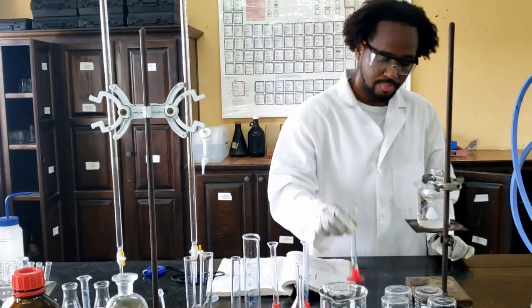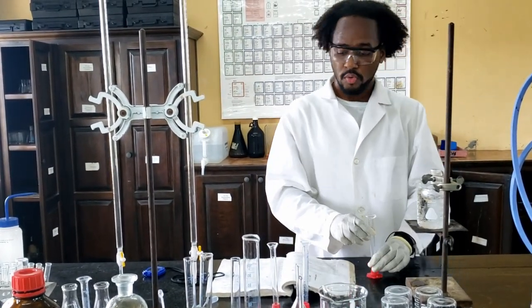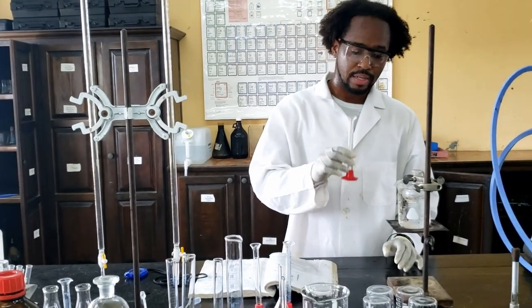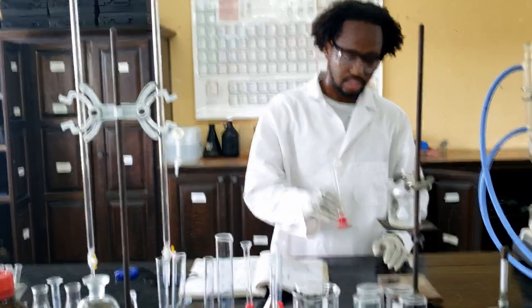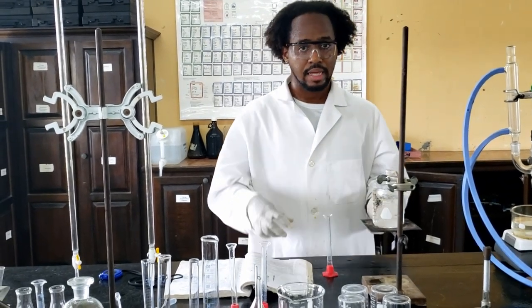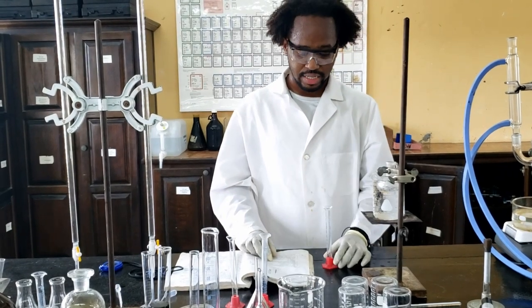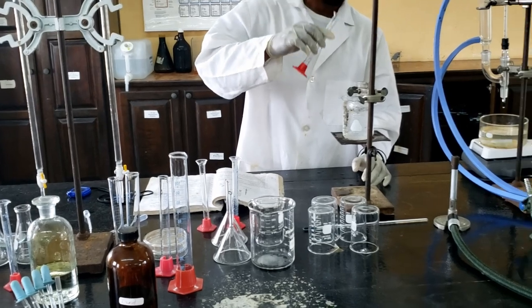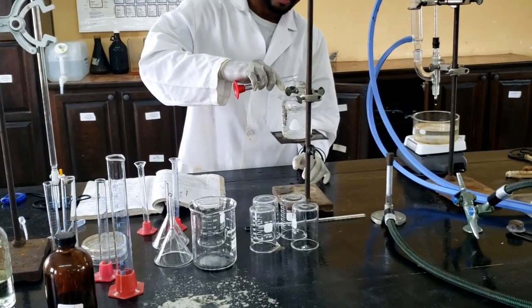This is 99% pure bromobenzene. Over a period of 10 minutes, I'm going to slowly add the bromobenzene until I've added all of it. Again, I'll keep it in the cold water bath, keep swirling and cooling after each addition. I'll just do small amounts over the period of 10 minutes.